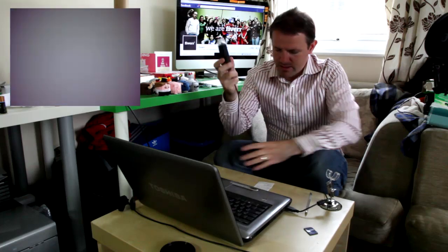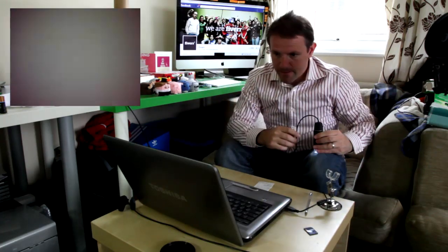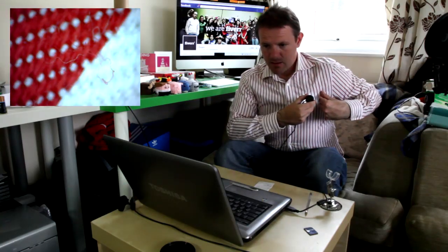Actually, have a look at my jeans — I did my jeans and it was quite cool. Let's just turn the brightness up again. Wow, there are my jeans! You can change the zoom — there's a button on the side of it. And that's what my jeans look like. My shirt — red and white stripes.